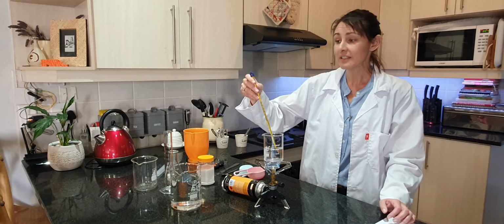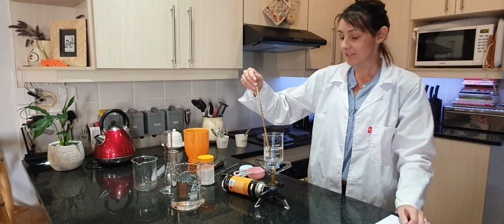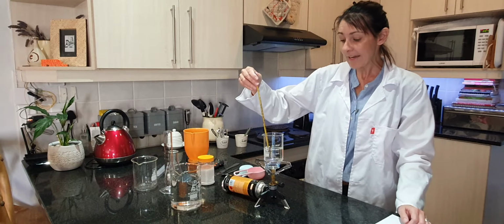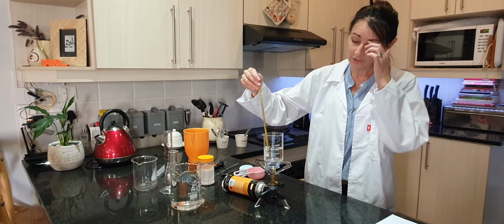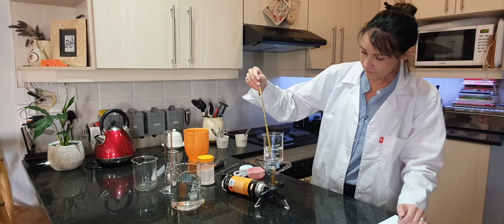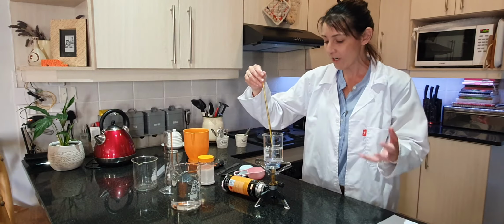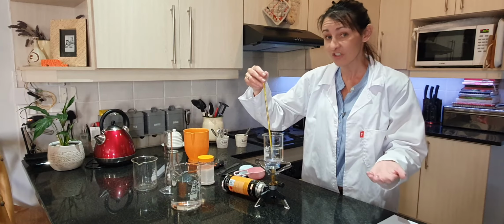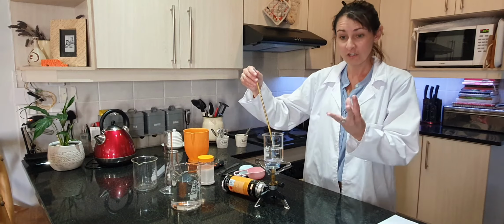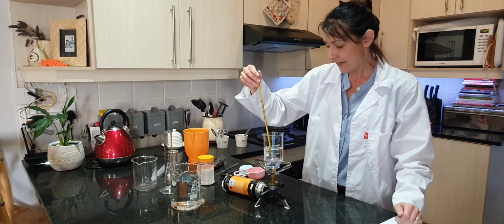There's no bubbles yet, so boiling point has not been reached yet. We are on 80 now, so it's starting to increase quite nicely. There are small little bubbles forming around my thermometer, but I need it to start boiling. Like when you put a pot on the stove and it starts to boil, you actually get those bubbles. That is what we're looking for. Now we are at 91.